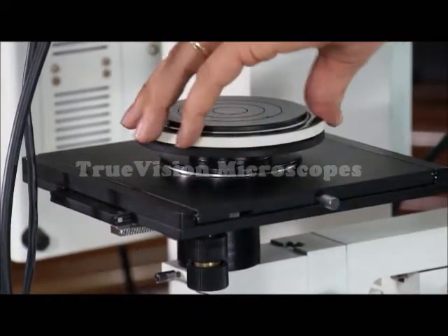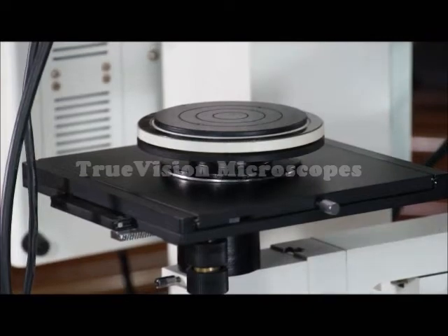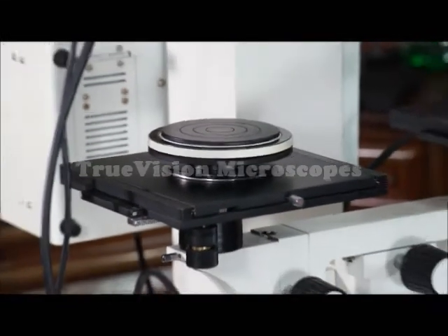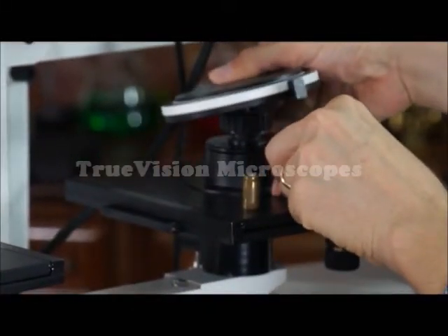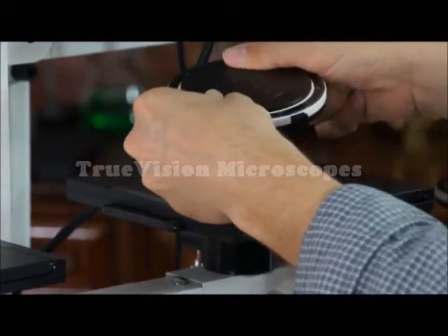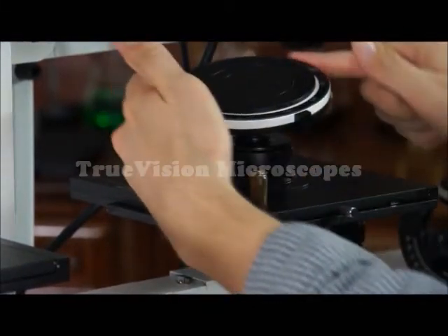They are rotatable. This holder is tiltable and rotatable at the same time.